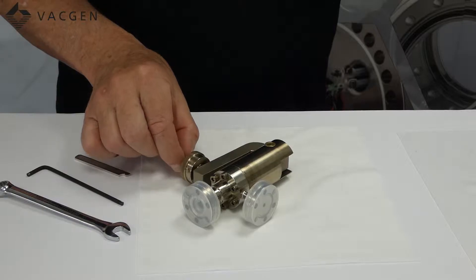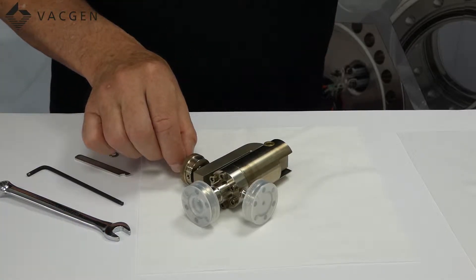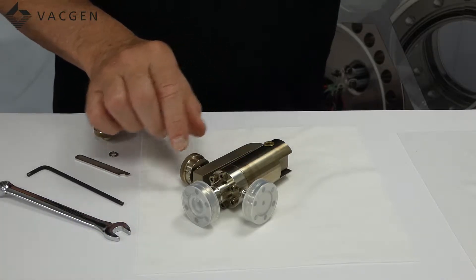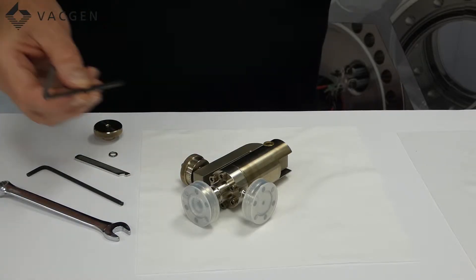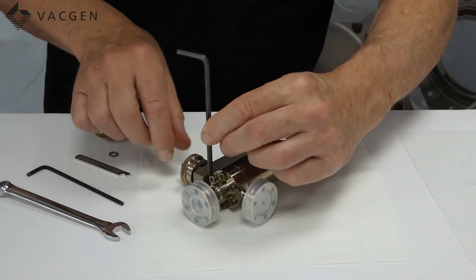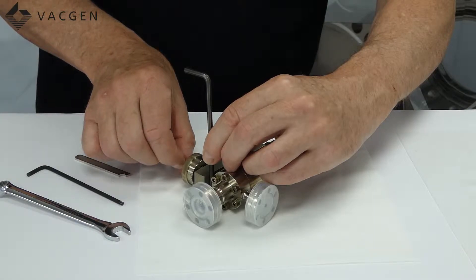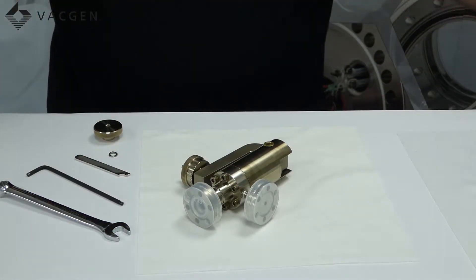The next part to do is to set up the arm. Normally somebody has been fiddling with this at some point and the arms are not in the correct place. These need to be slightly open or parallel, and the easiest way of doing that to check the gap is with a 4mm Allen key. You simply put it in between the valve and the arm and adjust it until the arm just opens, and you know then you have got a 4mm gap.